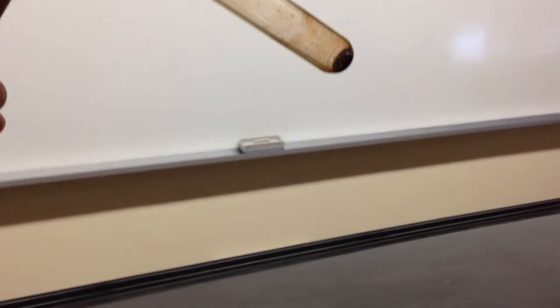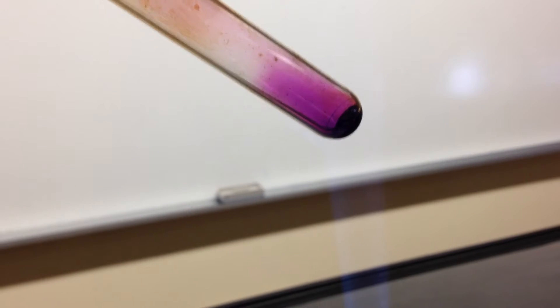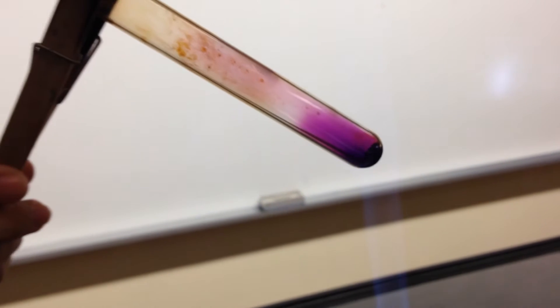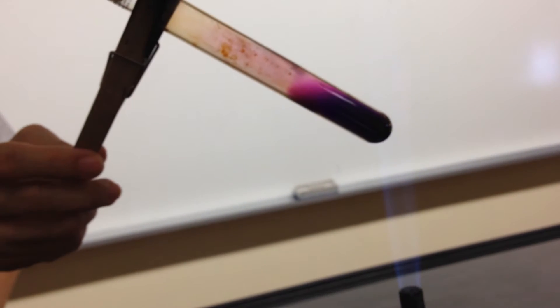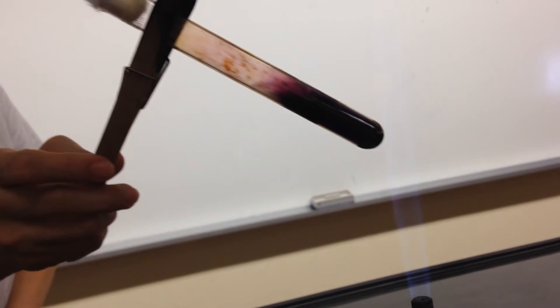When a small amount of iodine crystals is placed into a test tube and heated, a change in state happens. Notice how the solid iodine crystals form a purple vapor. This change from solid to gas is known as sublimation.